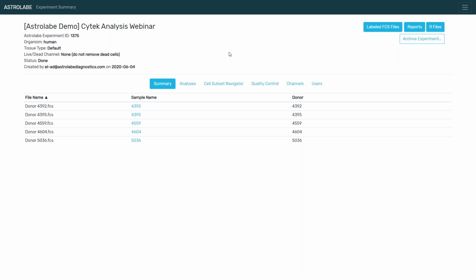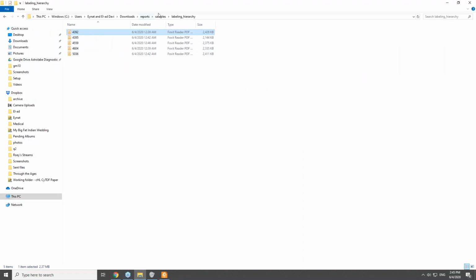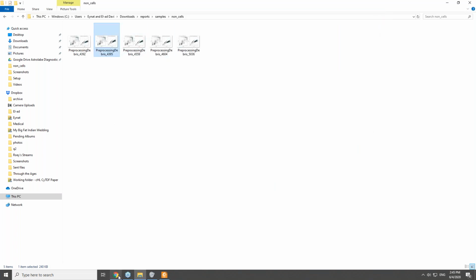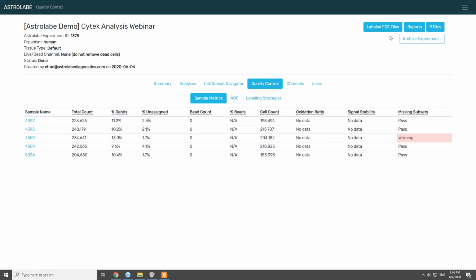And it cleans the data, honestly, based on what you know and what you expect. Going back to these figures I've shown you before, it's using forward scatter, it's using side scatter. If you want us to use CD45, we can use that. If you want us to use a live dead channel, we can use that. It's all customizable and the reports are available. We also have a quality control dashboard, which includes these statistics across the entire experiment. So you can quickly review the different samples. Again, you might have 5, you might have 50, you might have 500. This table is going to summarize all of the information and allow you to go through the cleaning results.